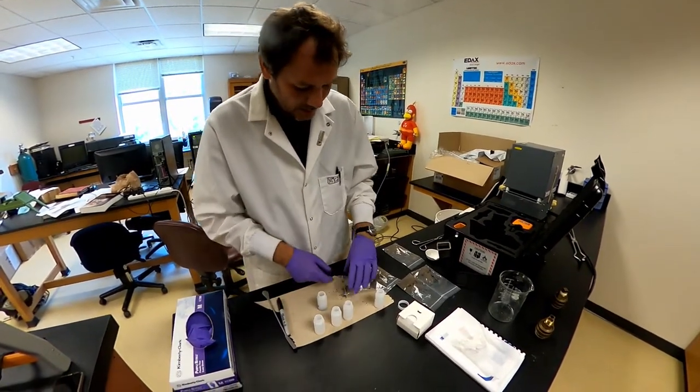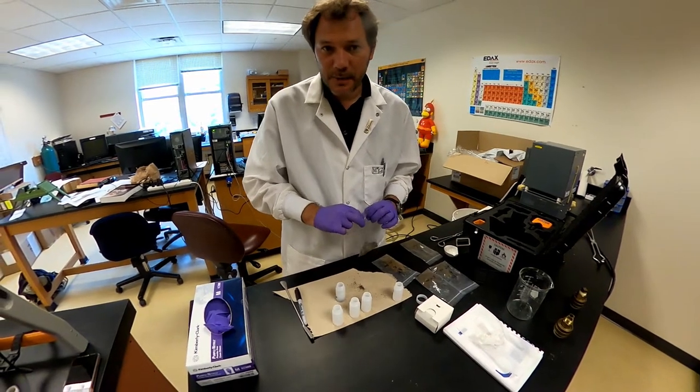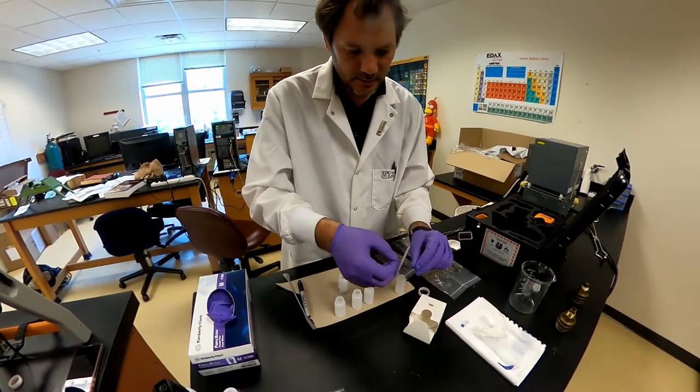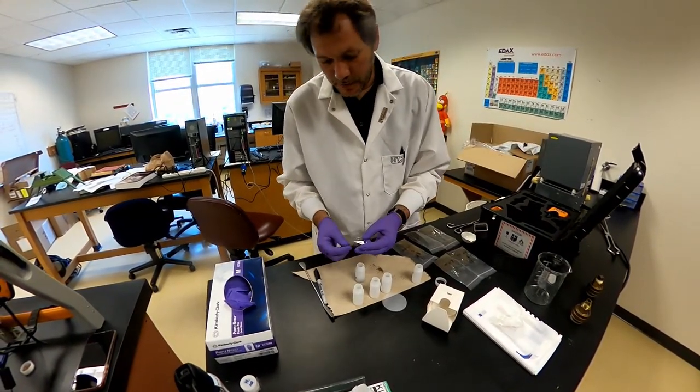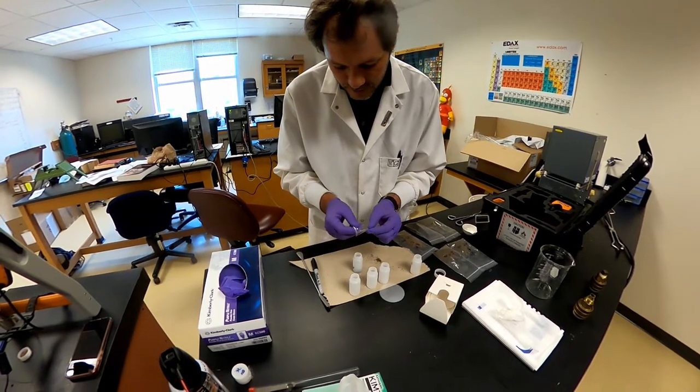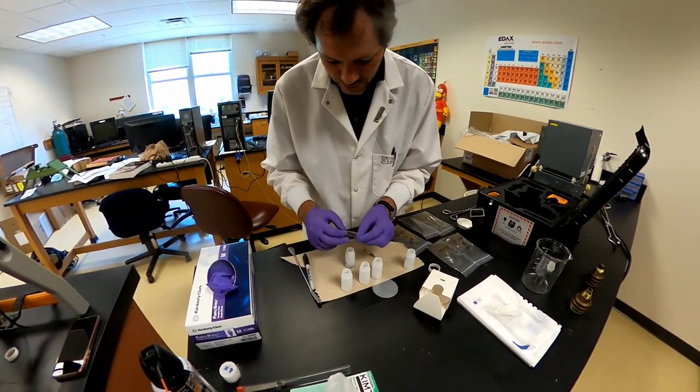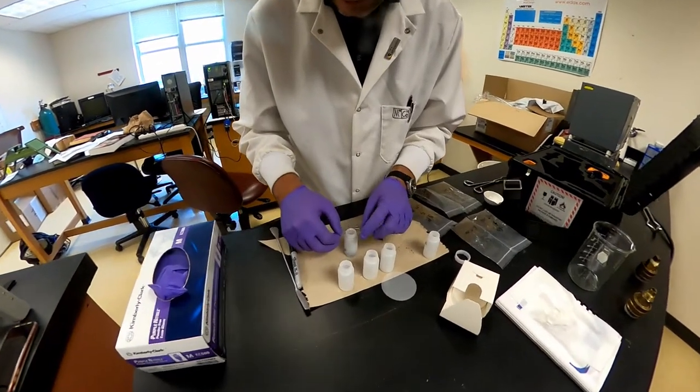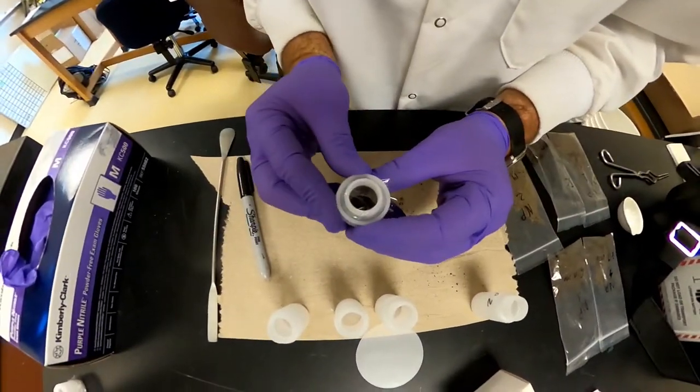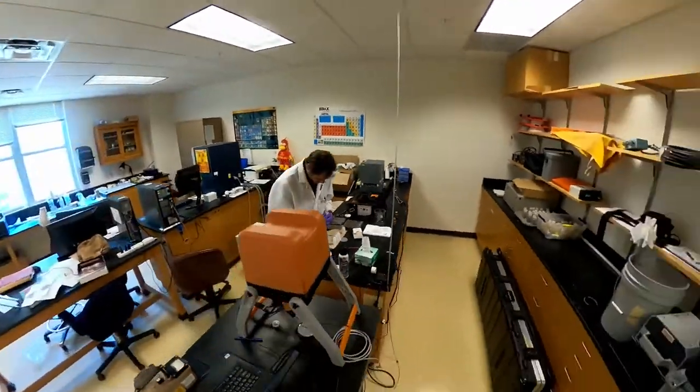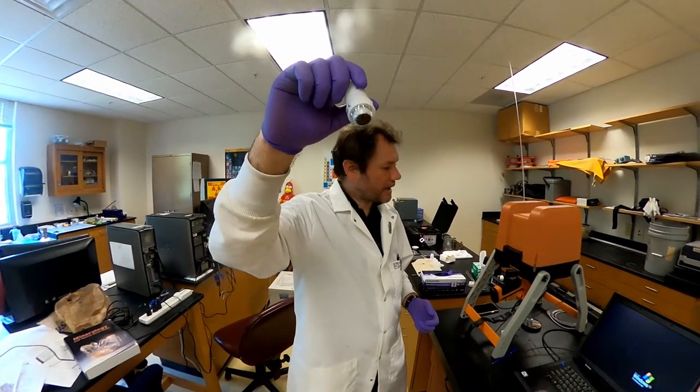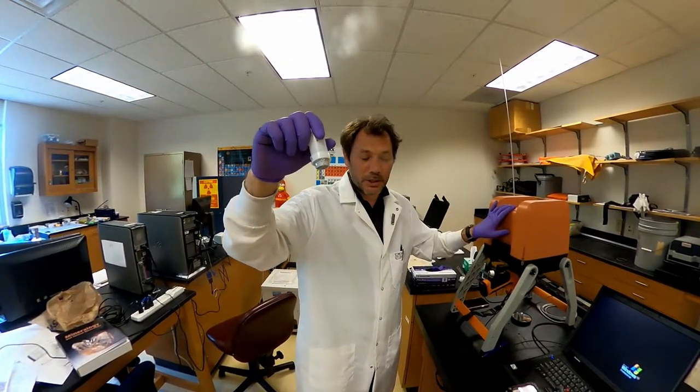And then we're going to cover that sample with an X-ray transparent film, which is in there, some kind of plastic that we know is not disturbing the X-rays and is not adding any contamination to the X-rays. It's only made of carbon, which cannot be analyzed by X-ray fluorescence. And that allows us to revert the sample and have our sample that will be in contact with the X-ray when we put it on top of the machine.